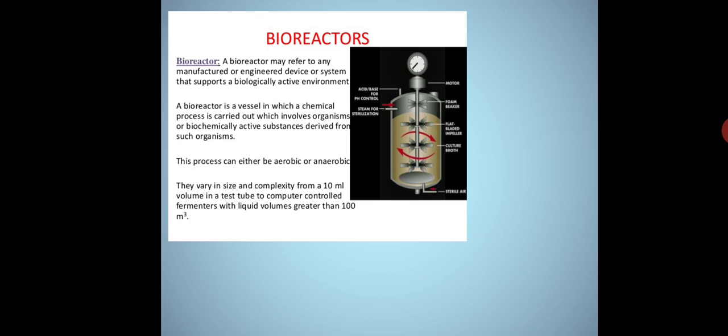In an earlier video, we have already discussed the difference between bioreactor and fermenter. These are both interchangeable terms, but there is a slight difference between fermenter and bioreactor. A bioreactor is used for culturing all types of cells like microbial cells, plant cells, mammalian cells, etc., while a fermenter is very specific, and is used for culturing of microbial cells.